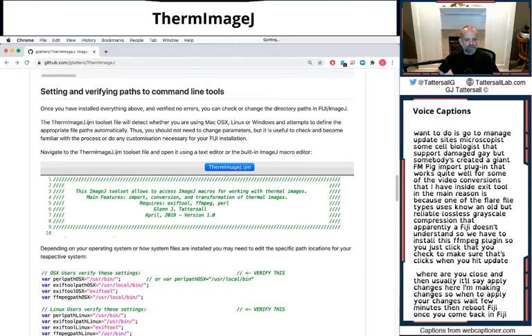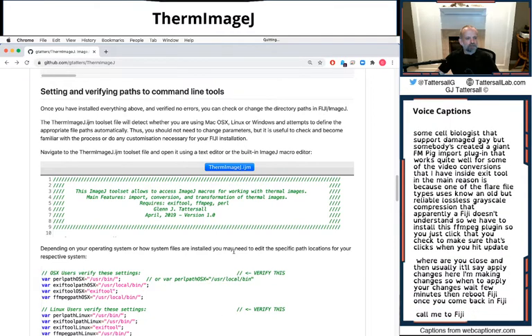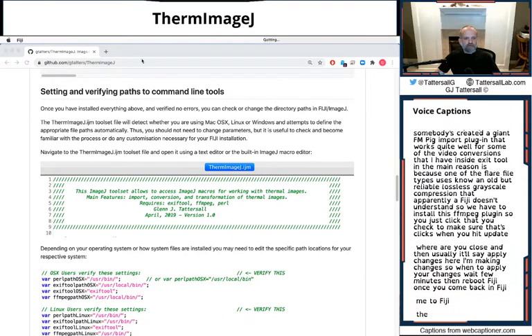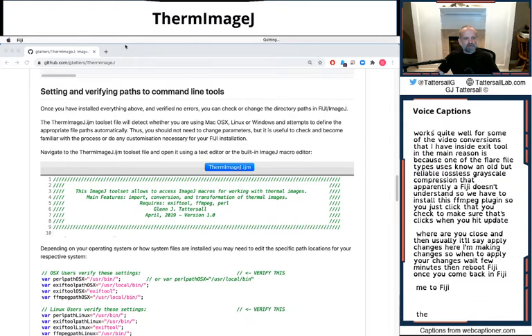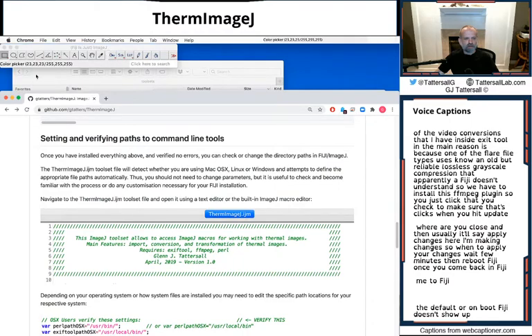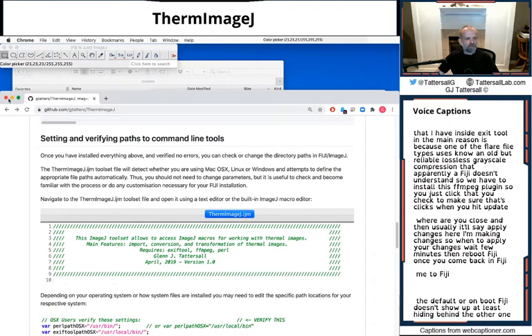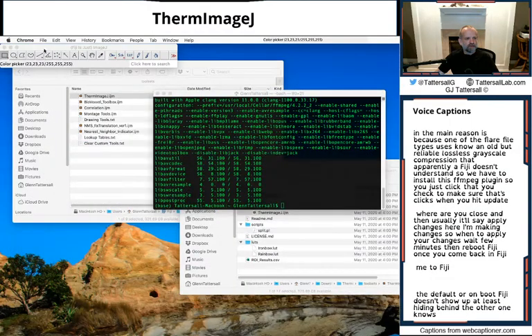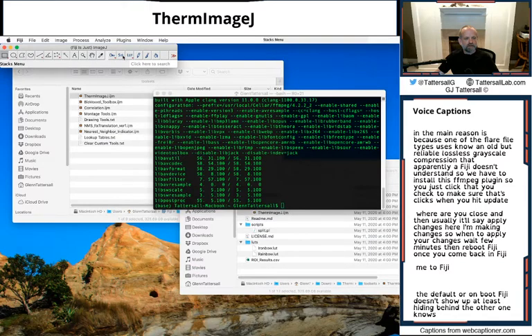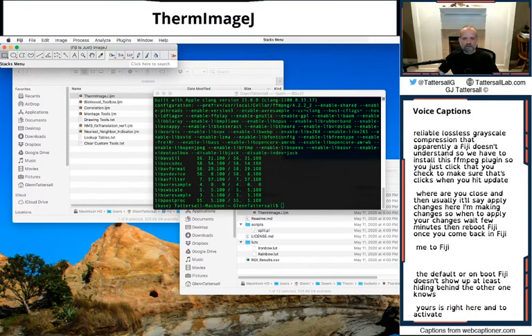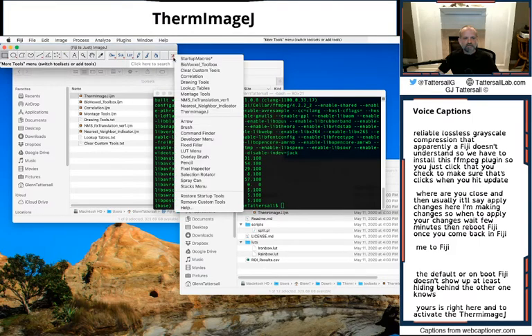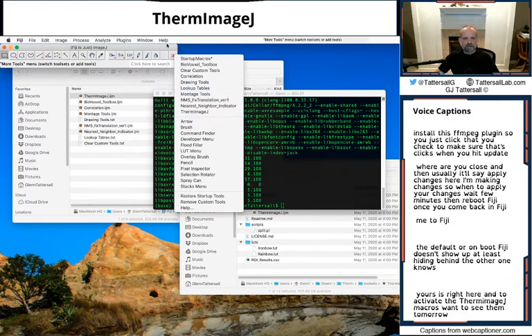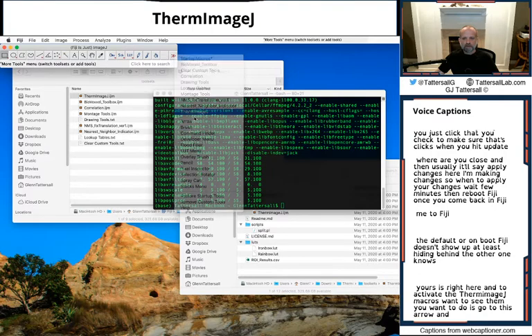On default or on boot, Fiji doesn't show up readily. It's hiding behind the other windows. Here it is right here. And to activate the ThermImageJ macros or to see them, what you want to do is go to this arrow and turn on ThermImageJ. They'll be there anyway, but at least you can see some of the little icons shown here.